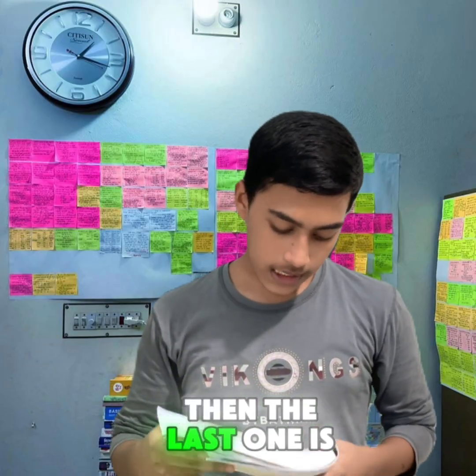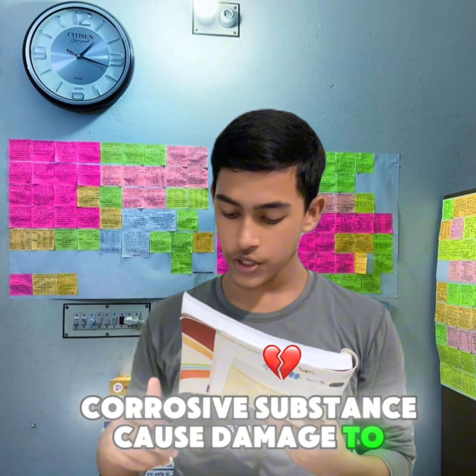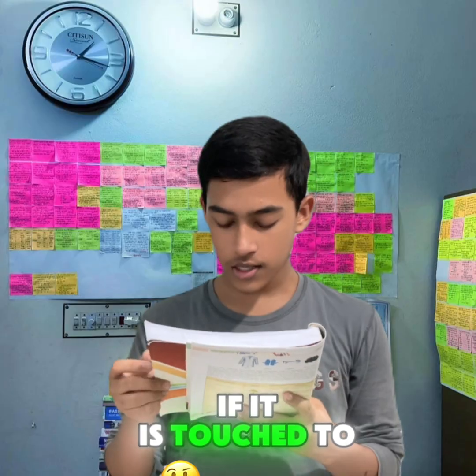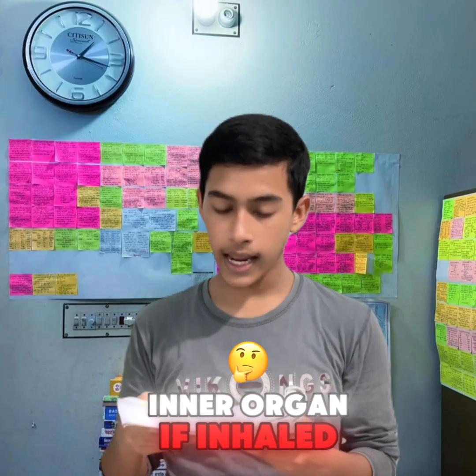Then the last one is corrosive substances. Corrosive substances cause damage to the body. If touched, they can damage the body, and they can also damage inner organs if inhaled.